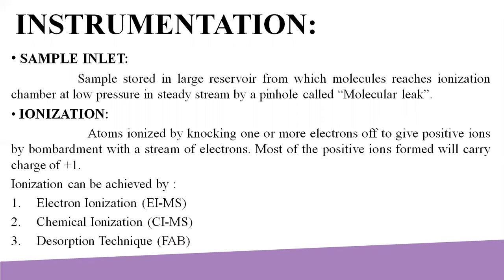The ionization chamber is kept in a vacuum so that ions are produced and progress through the instrument without running into molecules from air. Ionization is from electrons that are produced by heating up a coil until it releases electrons. The electrons collide with the sample molecules, knocking off one or more electrons. Since it takes more energy to remove more than one electron, most cations produced in the ionization chamber carry a charge of positive one. A positively charged plate pushes the sample ions to the next part of the machine.